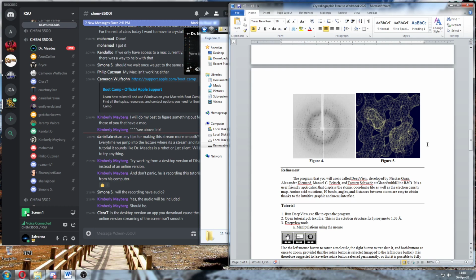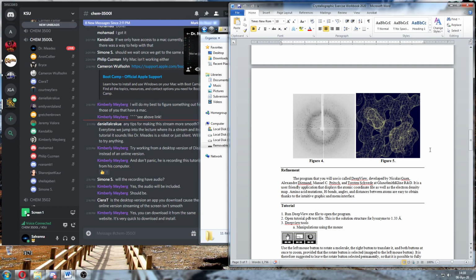There's also a histidine ring that you can see kind of standing out on the bottom right that's coordinating the iron in the center. Right? And someone mentioned that earlier, that why were there so many histidines in certain things? Well, they're good at coordinating metals, right? Cysteine as well. Right? So what I want you to do is let's practice, or you guys can watch and do this along with me, but if you have questions, just ask.